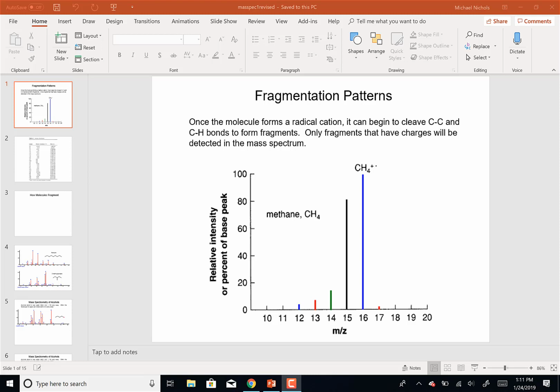So where we were last week was we talked briefly about the technique of mass spectrometry. So what was the big thing in mass spectrometry from last week? There is a stream of electrons that are pumped at the particle that's moving by, to fragment it into multiple different components.